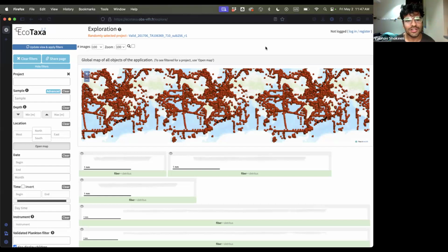So how do you clean it after use? Basically what we do is we flush all of our sample out from the Plaktoscope fluidics, and then we rinse with clean water. Usually that's enough if you just need to clean it between samples.